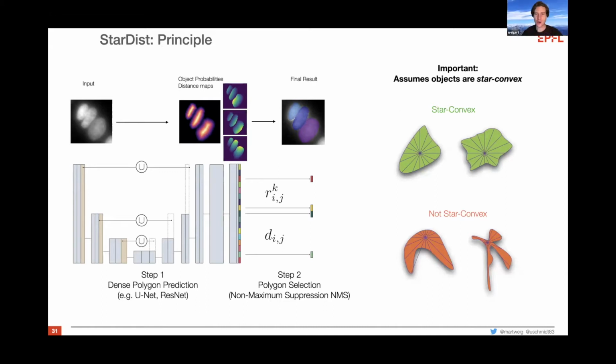Of course, your object of interest that you want to annotate has to be able to be represented with such an approach. And these objects are called star convex. It's a little bit a weaker constraint than being convex, but it kind of just means that in whatever you want to be represented by that approach, you can find a center, one point in the middle at least, where you can see all the boundary along these predefined rays, right?